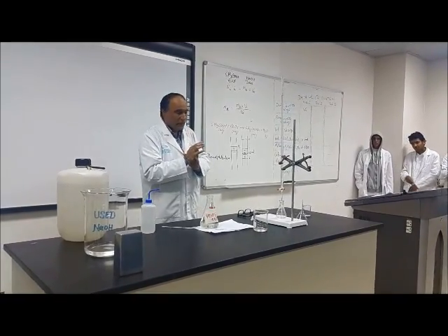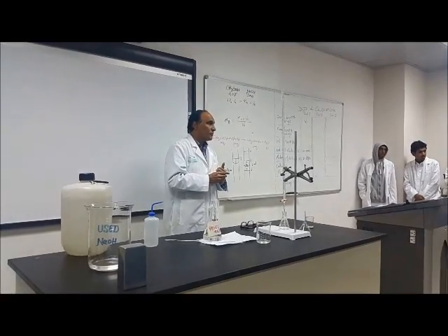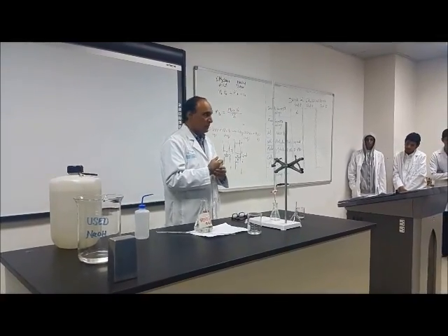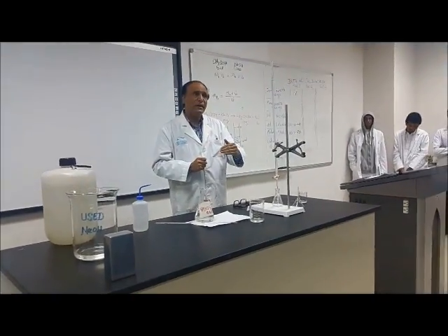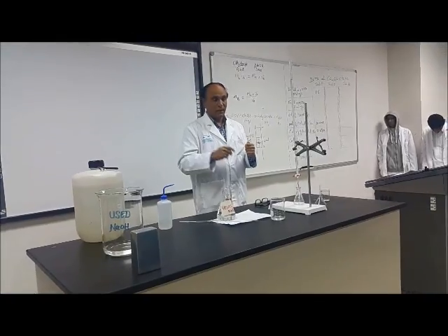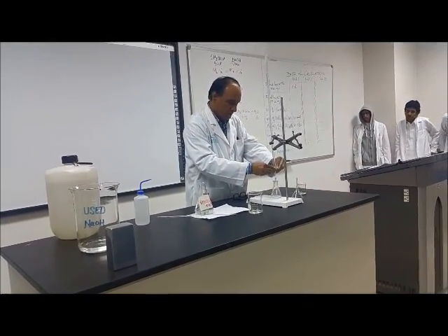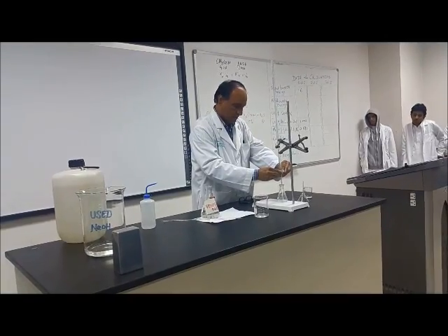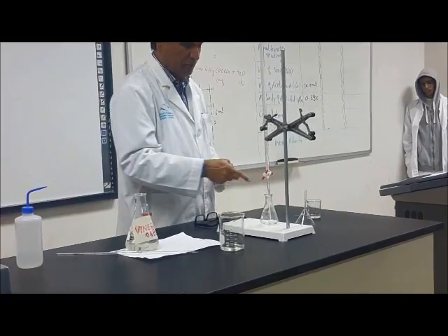Okay? When I do the experiment, I will show you. Now, I will control it in such a way that I will not put too much. I will put, for example, drop wise. Do you see that? I am putting drop wise.